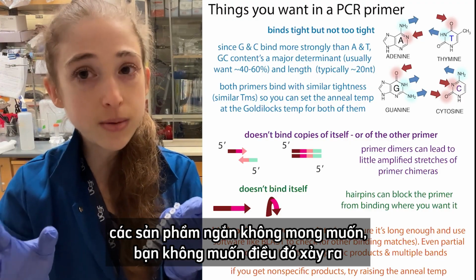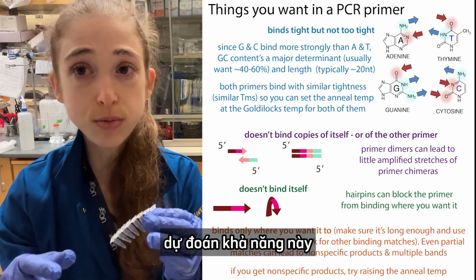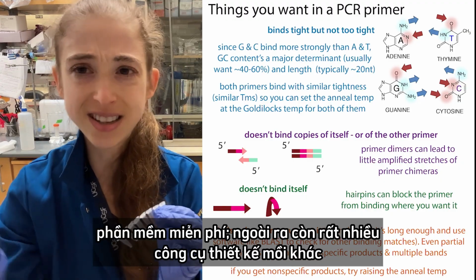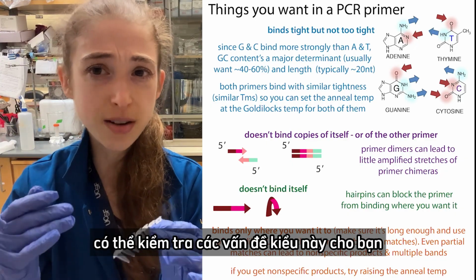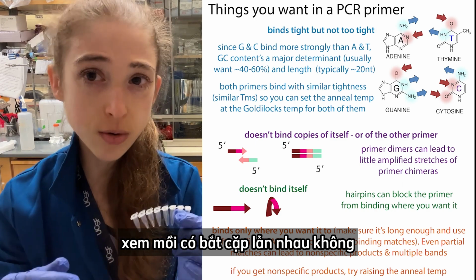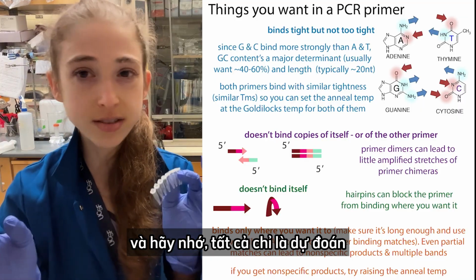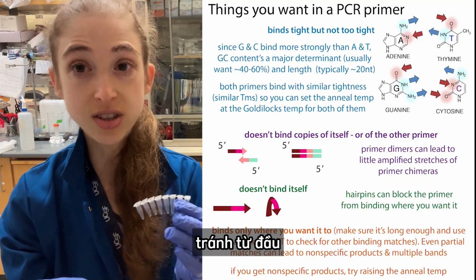And that's not what you want to happen, and there are various software tools that you can use to predict whether this is going to happen. I use Amplifx, which is free software you can use. There are also all sorts of primer design software that will test whether your primers bind to one another, whether they bind to copies of themselves, whether they fold up on themselves. And remember, this is all just prediction, but you want to make your primers so that they're not predicted to do that.